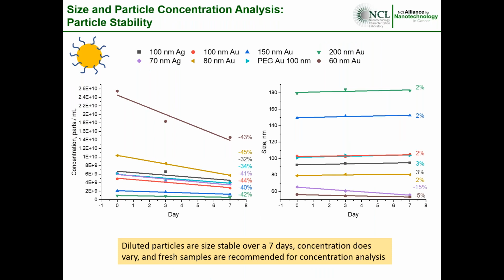So when I was carrying out these experiments, we had some power issues where some of my runs got cut short because we had a power surge or the power went out. And when I was redoing all of these solutions to create very long calibration curves, I was interested in knowing how the stability was, because I kept having to redo this multiple times. Especially since single particle counting requires pretty extensive dilution of these particles, it's really good to know if they're going to be stable, how long they're going to be stable, and what we should expect.